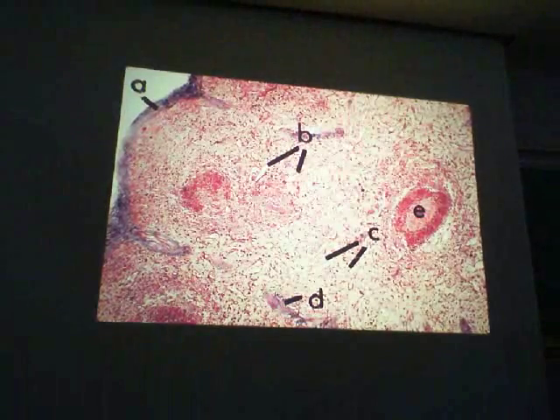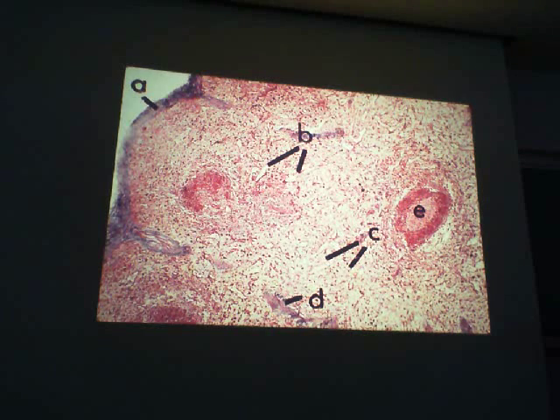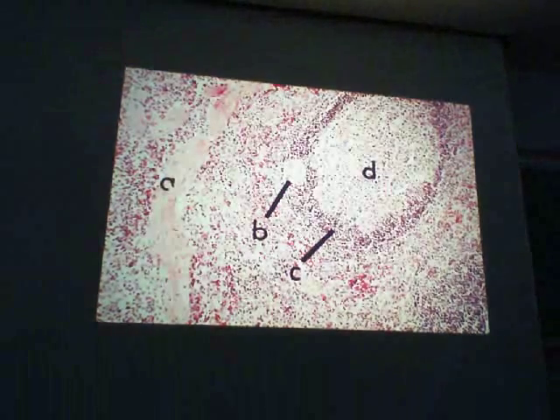Okay, so spleen again, a little bit better differentiation of the stain. There we have white pulp, we have red pulp, and in this case, they probably closed off the splenic vein to back up some blood in these venous sinuses, so they stood out a little bit better. We don't have slides like that that are quite as good as showing that in the laboratory.